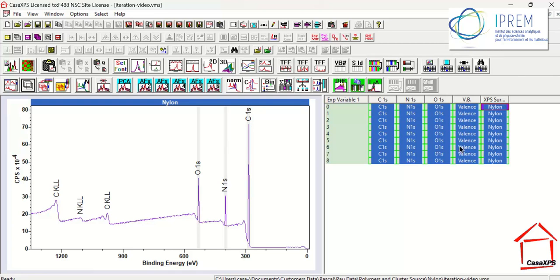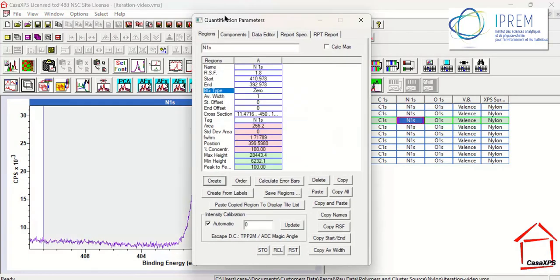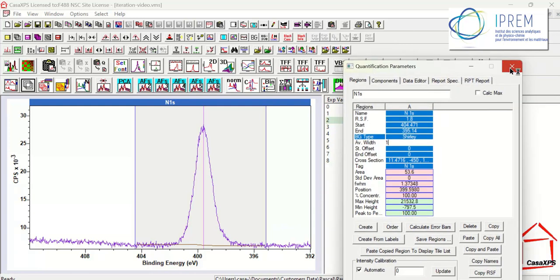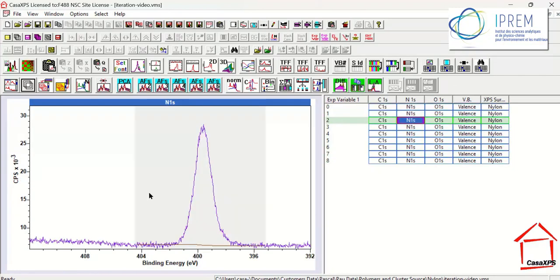For example, in this set of spectra, we may have defined a region on one of these nitrogen spectra. So let's put a region that we can recognize, and then we go and look at some other data and we want to say, oh, I wonder which one it was that we analyzed with the region, and so we can then recover the information about which ones have regions, and that's the one that I was working on.